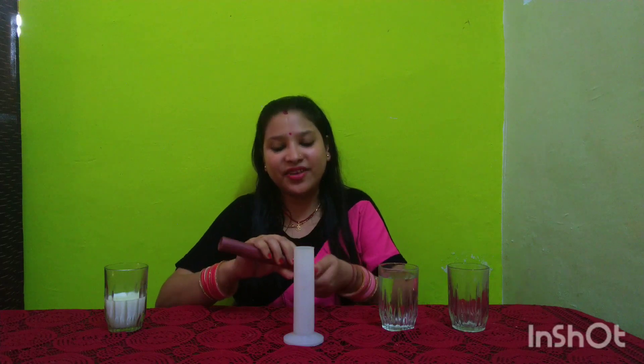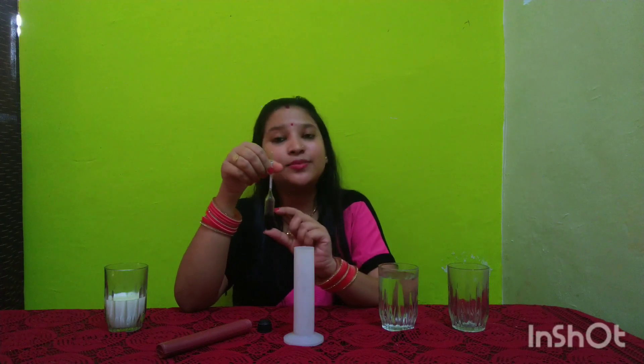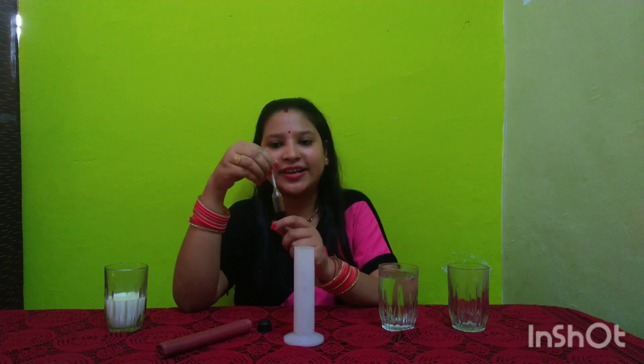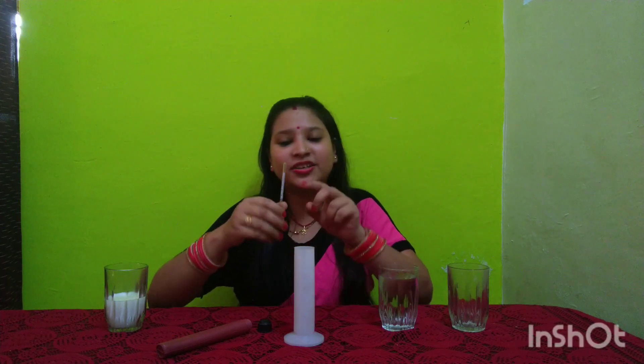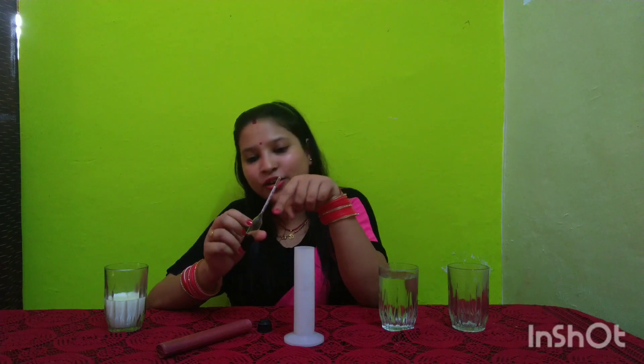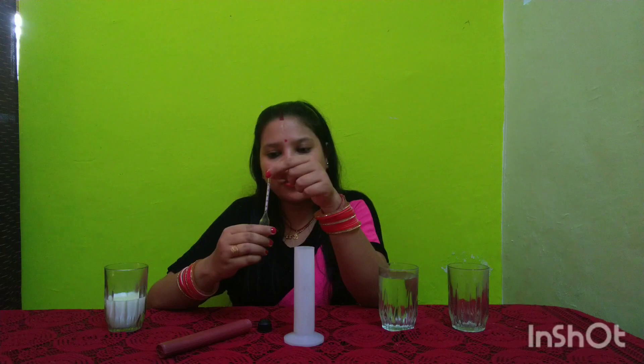This whole instrument is called a lactometer. We have basically two components: this is the lactometer jar, and inside we have the actual lactometer. As you can see, it has a glass body and the base is filled with mercury. It is generally calibrated — the reading starts from 0, 10, 20, 30, and goes till 40. We also have another calibration scale showing one-fourth, one-half, three-fourths, and so on.